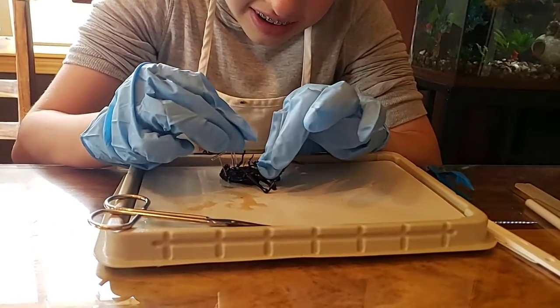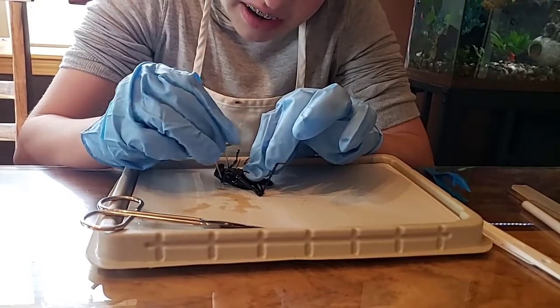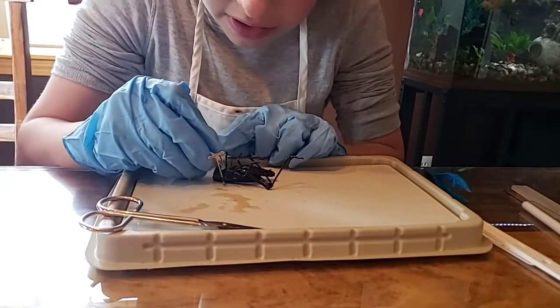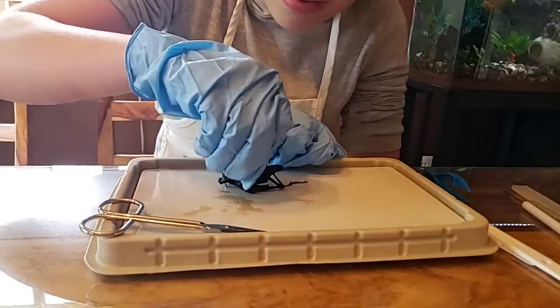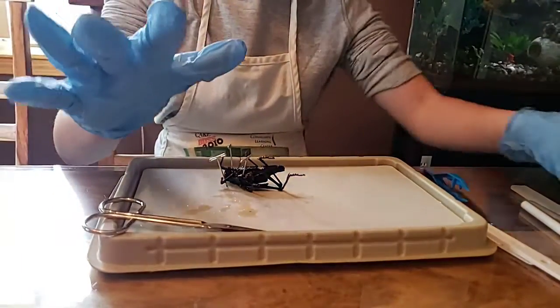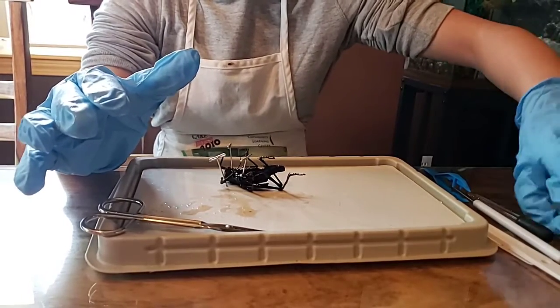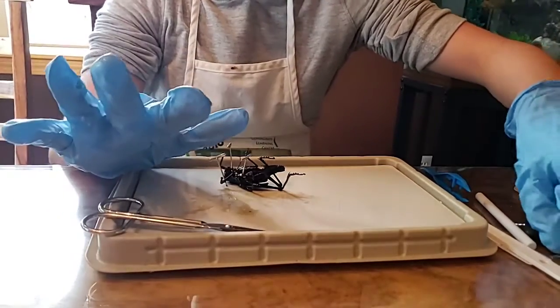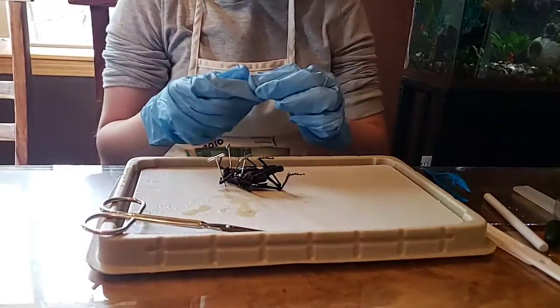All right, so while you guys are opening these up, you want to pull the cut sides apart. That's what we're trying. This is really hard. There's brown mush inside of here, no organs. We're going to be looking at the thorax first. So, Lanston, you got to cut all the way up through here. You guys got to take your pinning needles, put them in here, and then stretch them sideways, okay? You just stretch them open more, Tan. I'm trying. I have to get this side open now.